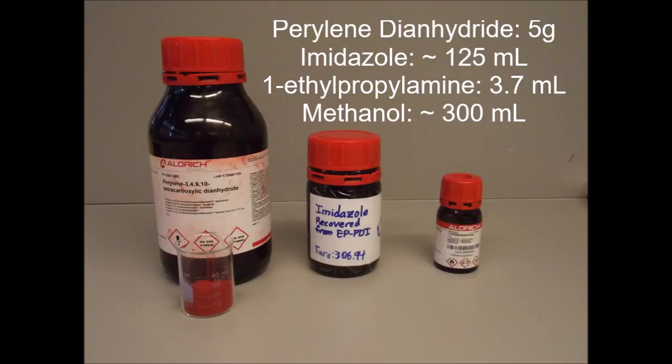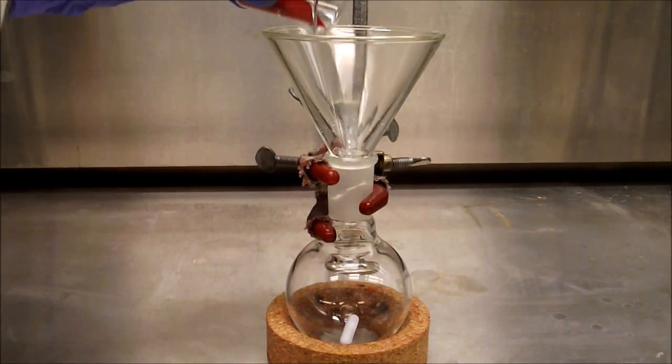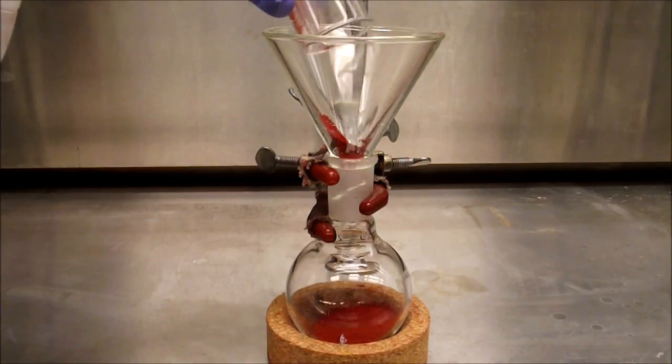First, five grams of perylene dianhydride is added to a 250 milliliter round bottom flask.